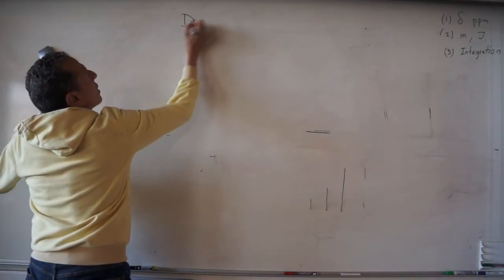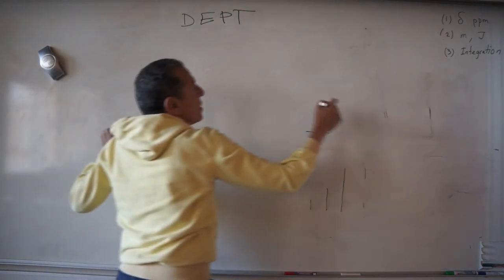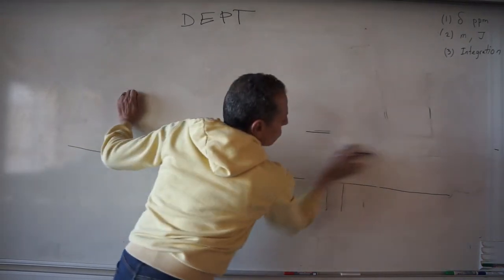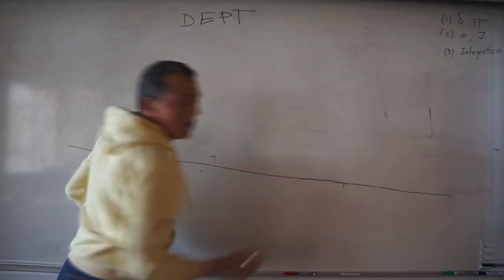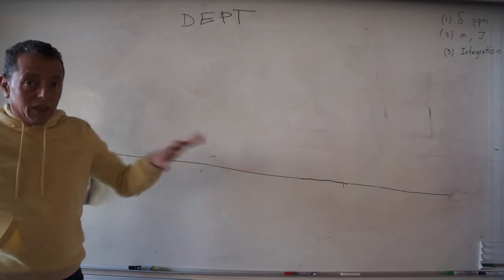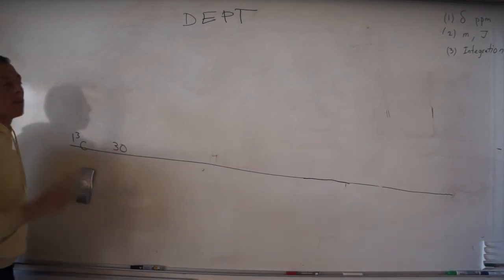With DEPT, you first get the carbon 13 of the whole structure, meaning all the carbons in the structure. If you have a terpenoid with 30 carbons, and the 30 carbons are magnetically and chemically different, you will see 30 peaks. So in the first carbon 13, you will see the 30 peaks, right?